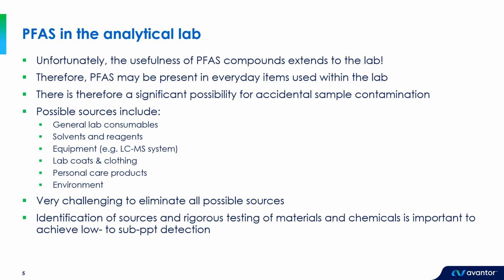It's always important to remember that due to the very low detection limits mandated for PFAS, we're working at trace levels, so even very low-level contamination sources do have the potential to be problematic.